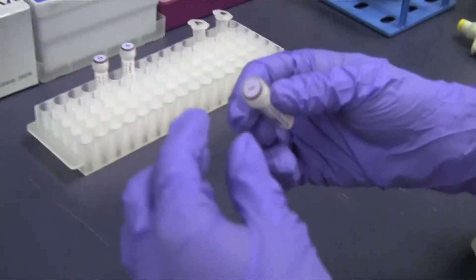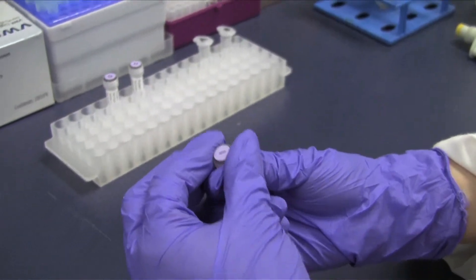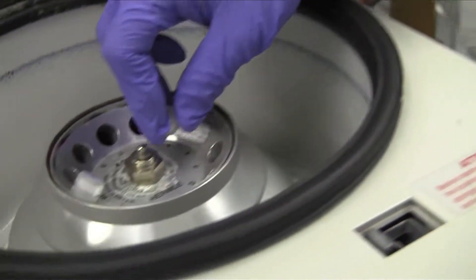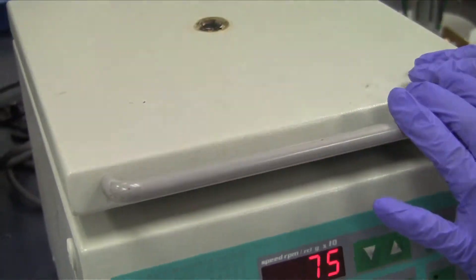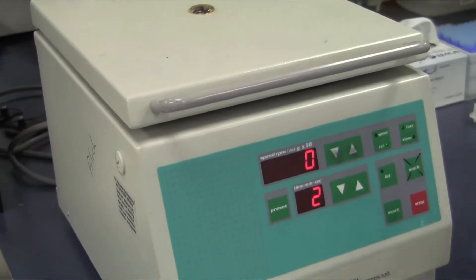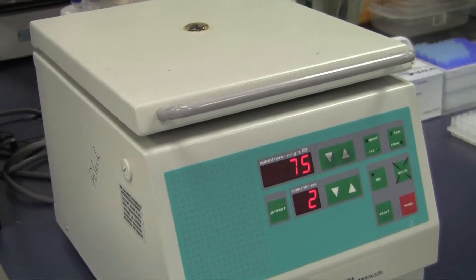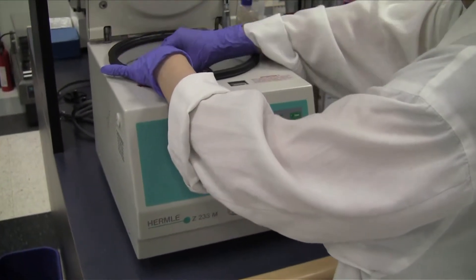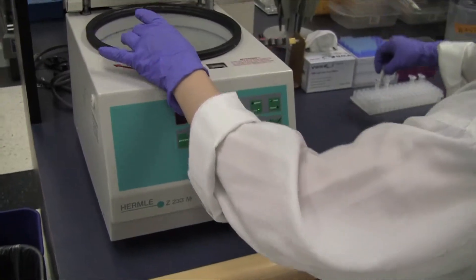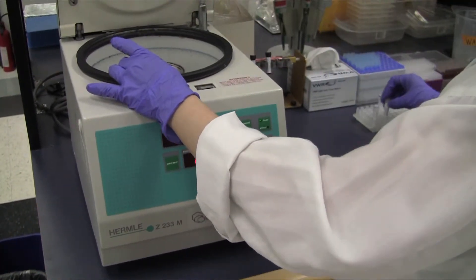Place the column into a collection tube part CAMI and centrifuge for 2 minutes at 750 times G. Remove the column and discard the collection tube with liquid.